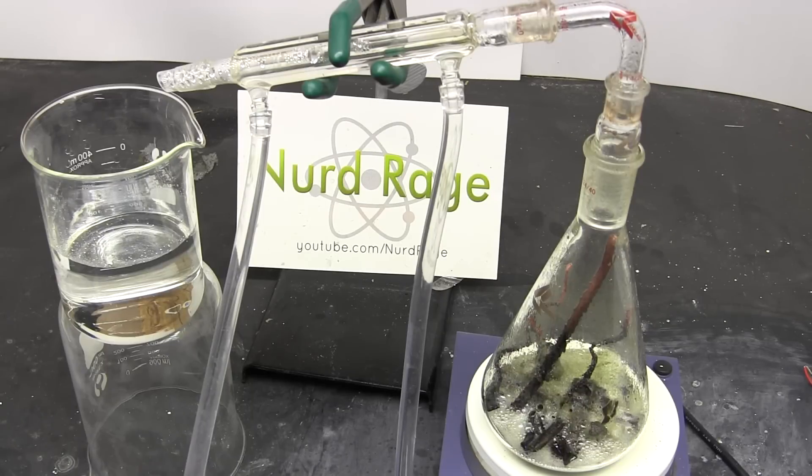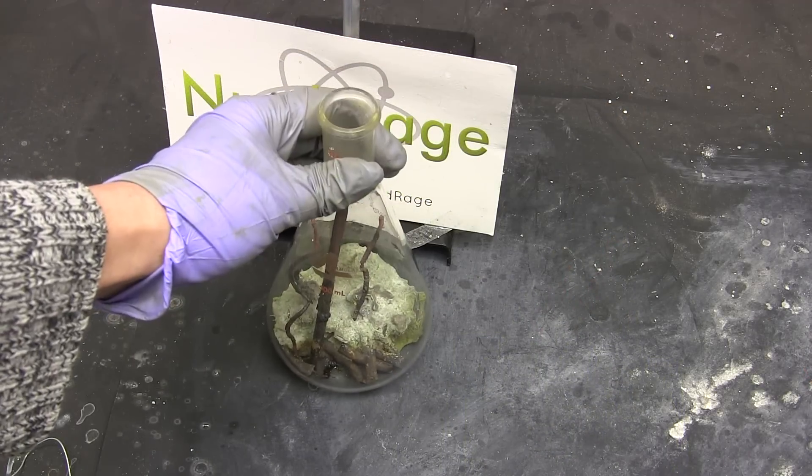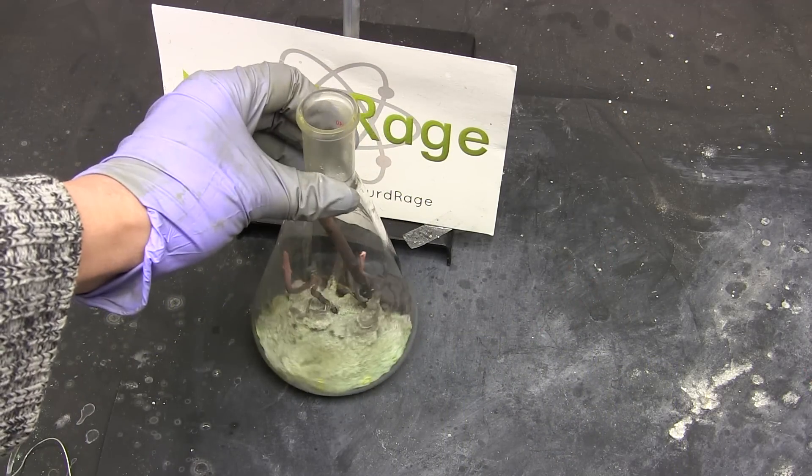Anyway, looks like my run worked out. Turn off the heating and let it cool. You can see here the cake of light green copper 2 chloride and white copper 1 chloride.